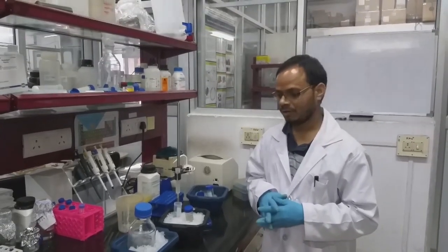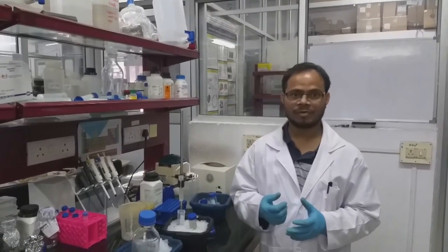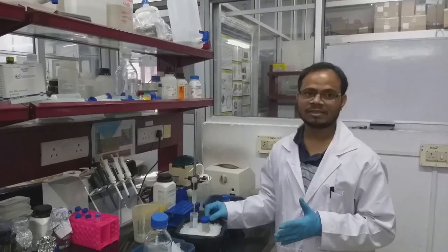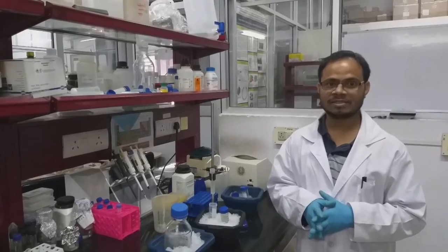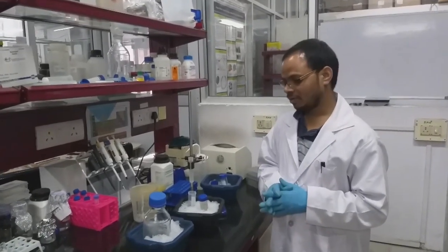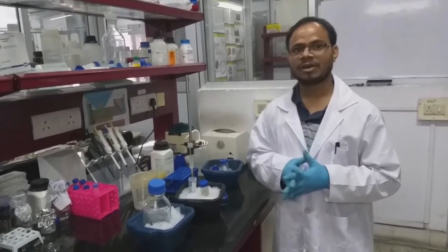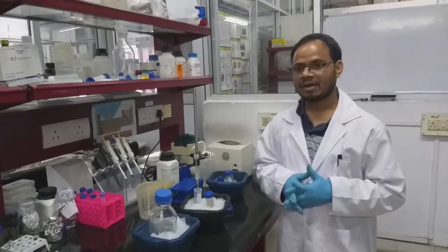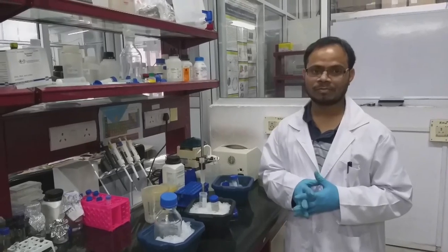While doing purification, we have to remember that every time you are introducing a new buffer, you have to collect the fraction, and this can be used for running SDS gels and testing the purity of the samples. And also the flow through part and the washing part that we have collected, we have to keep it safely. Only after verification of the gel do we throw it.